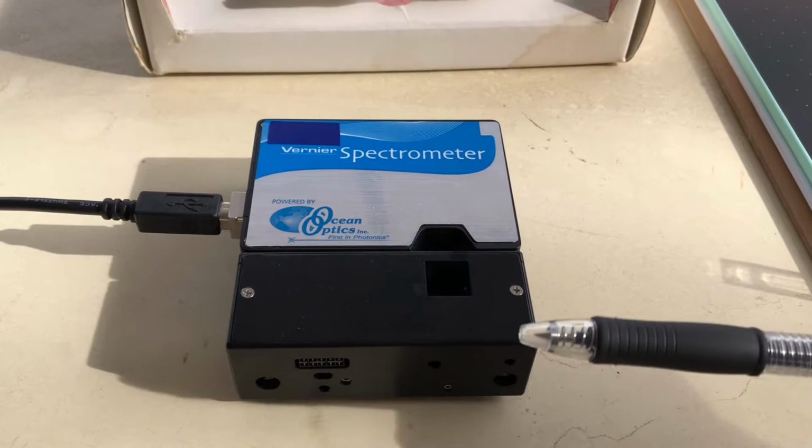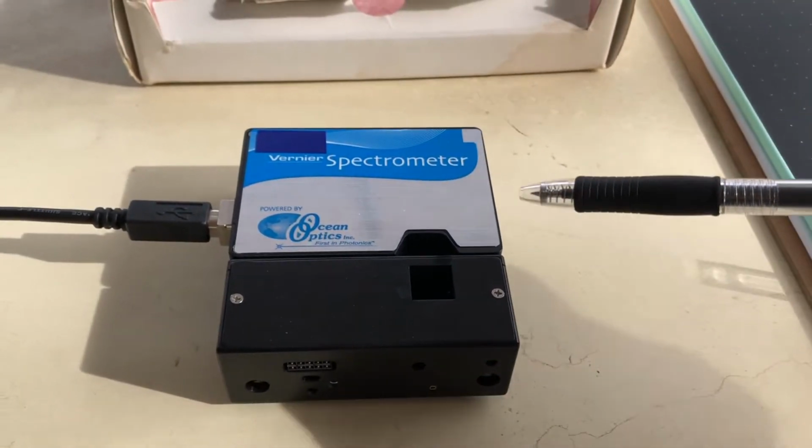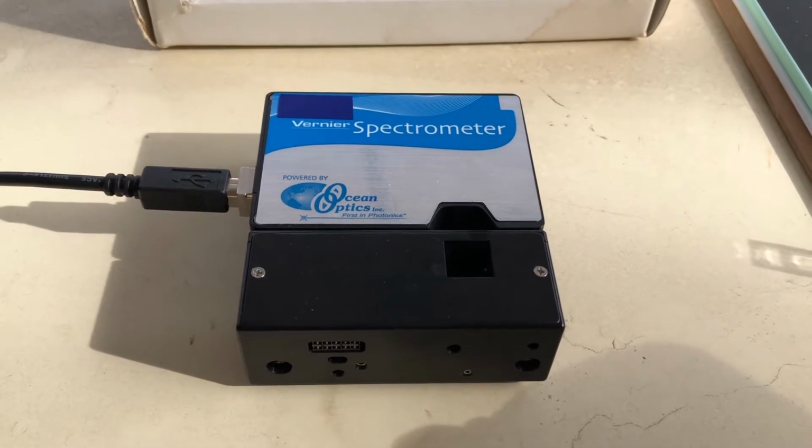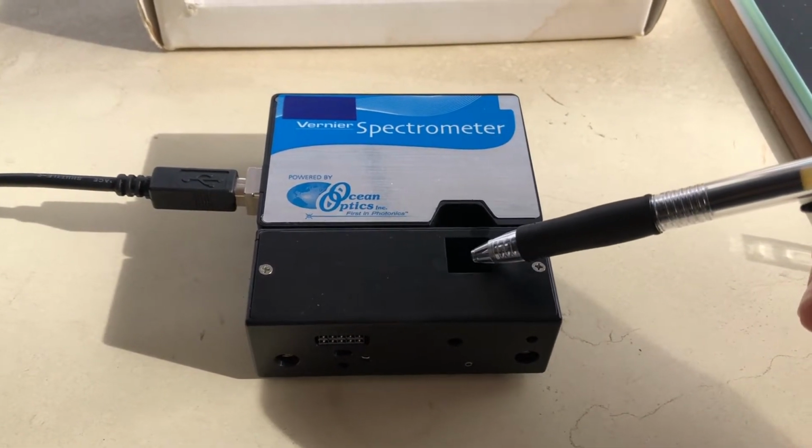So this here is our spectrometer. This is what we would be using if we were in the lab and we were actually running different samples to collect absorbency values on certain concentrations. So right in here is where your sample would go.